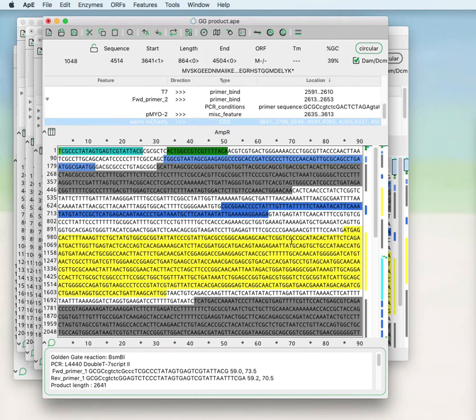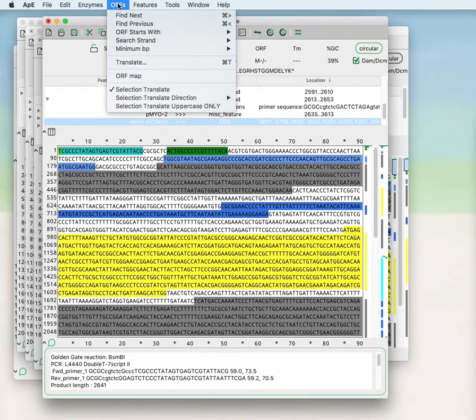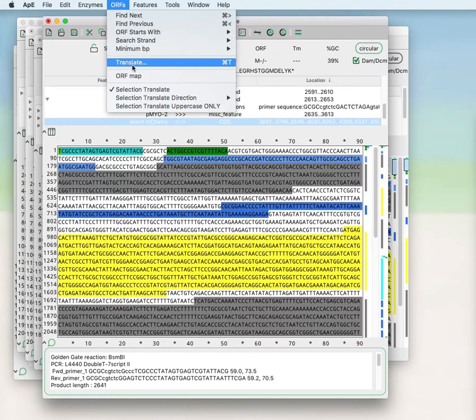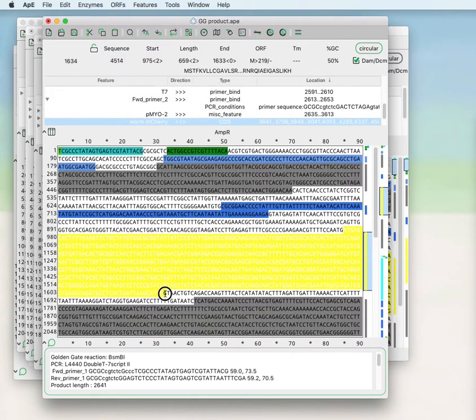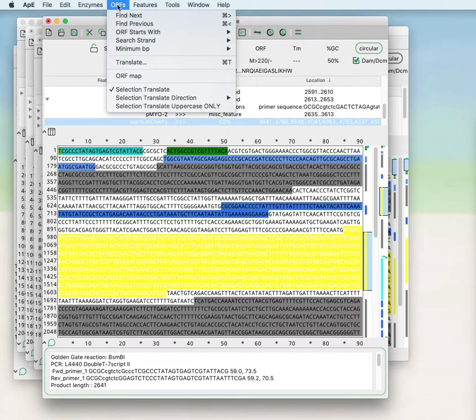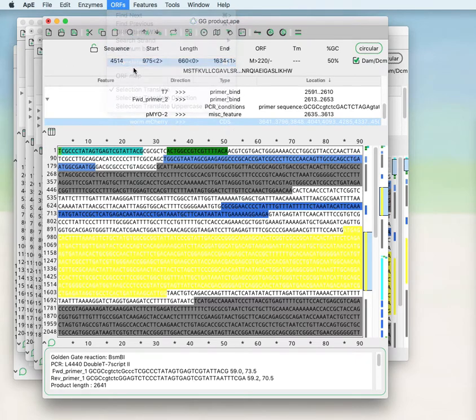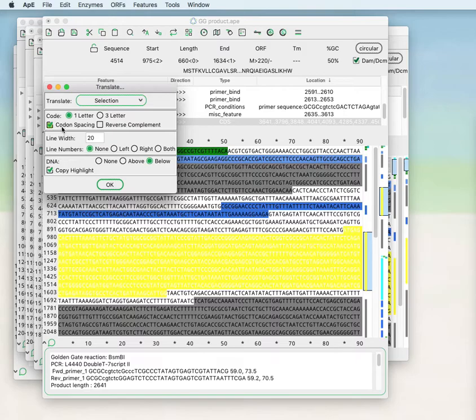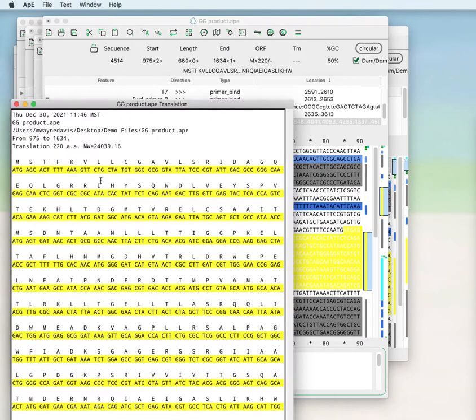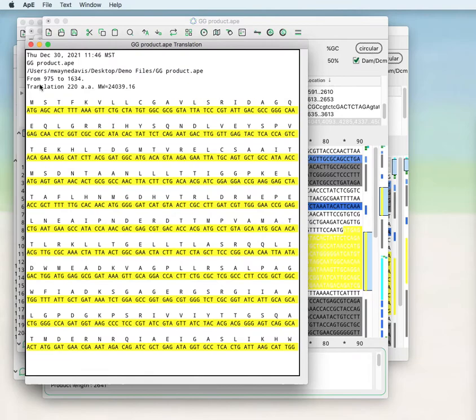The first tool that we'll talk about is available under the ORFs menu within the main menu, called Translate. If you select a cDNA sequence and select Translate, you can translate the current selection. Then you can set how you would like the translation formatted. Click OK and it will generate a simple text translation of that region.